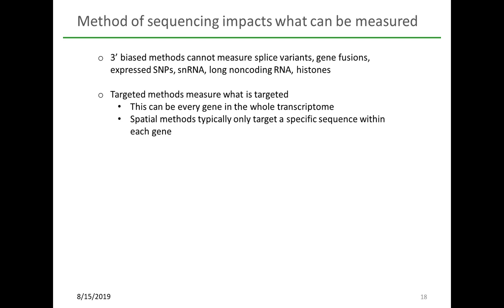So basically then, the method, whether it's 3' based or targeted, is important. And if it is targeted, can it measure the whole transcriptome or not, is important to know as well.